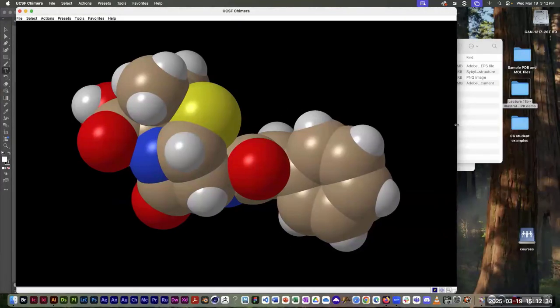All right, so while you all were on break, I went ahead and opened up a different molecule, a little bit more interesting, although I never could figure out where the setting was to change the relative size of the spheres. I know that hydrogen is supposed to be significantly smaller than carbon, oxygen, and nitrogen, and that bright yellow one is sulfur. But these strike me as quite small, but I'm not going to worry about it. We'll work with it.